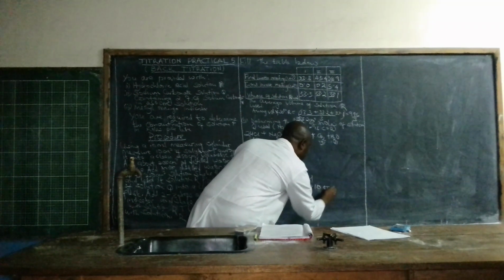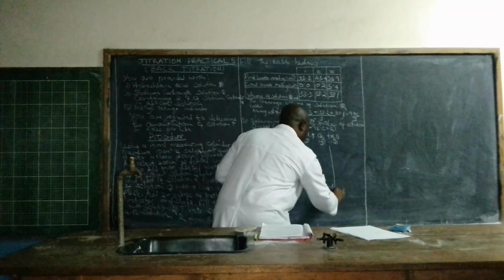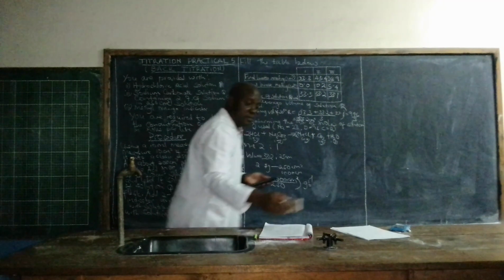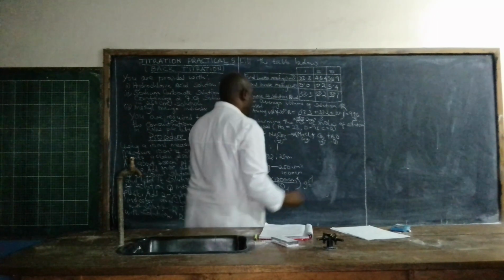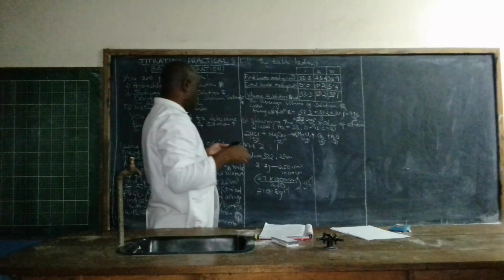That is 10.8 grams per liter. After you have done that, you are supposed to ask yourself this question.